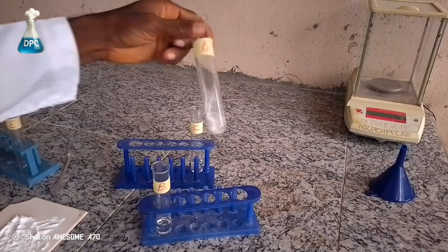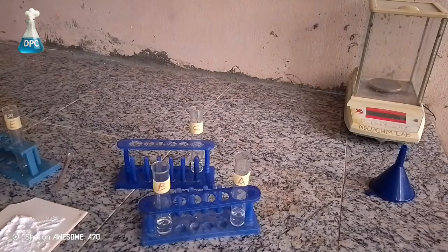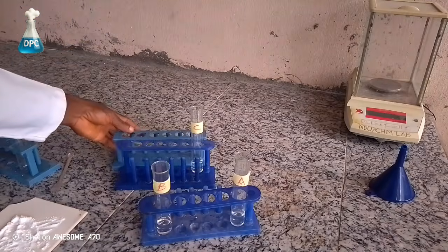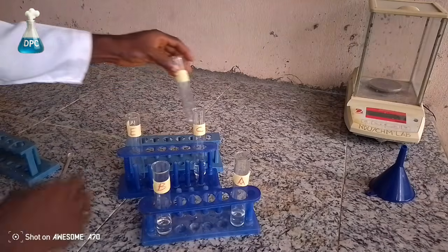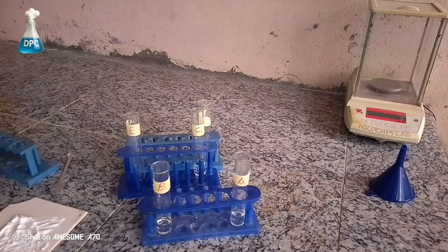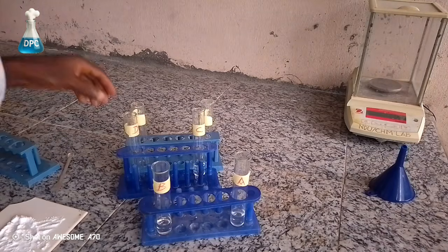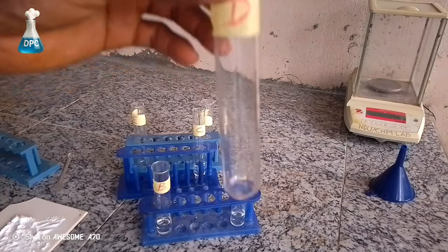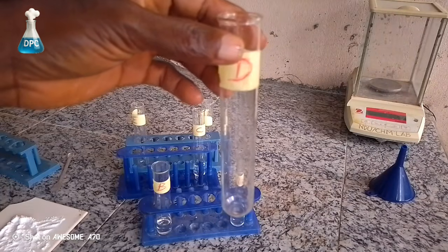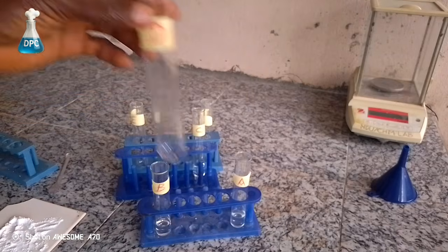Our test tubes A, B and C are now ready. Now we can prepare for the acid solution, which is vinegar. Now we arrange test tubes and label them test tube D, E and F. Test tube D will contain 5 ml of the acid, which is vinegar.